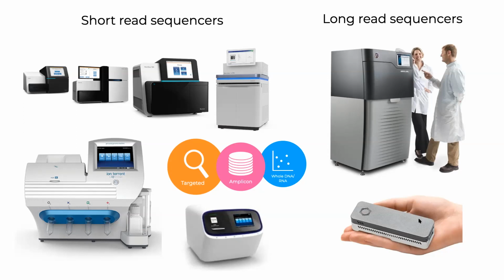So really long sequence reads. And those, for example, are used today when the areas of the human genome with many repeats are being studied. A lot of times, these types of sequencing approaches could be much more expensive, as we see with PacBio, much more expensive than Illumina, or much cheaper. For example, Oxford Nanopore, much cheaper.